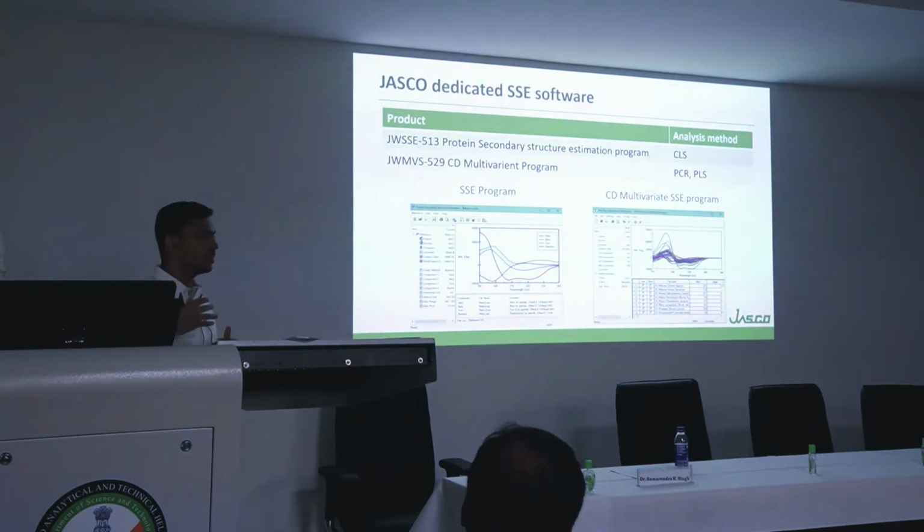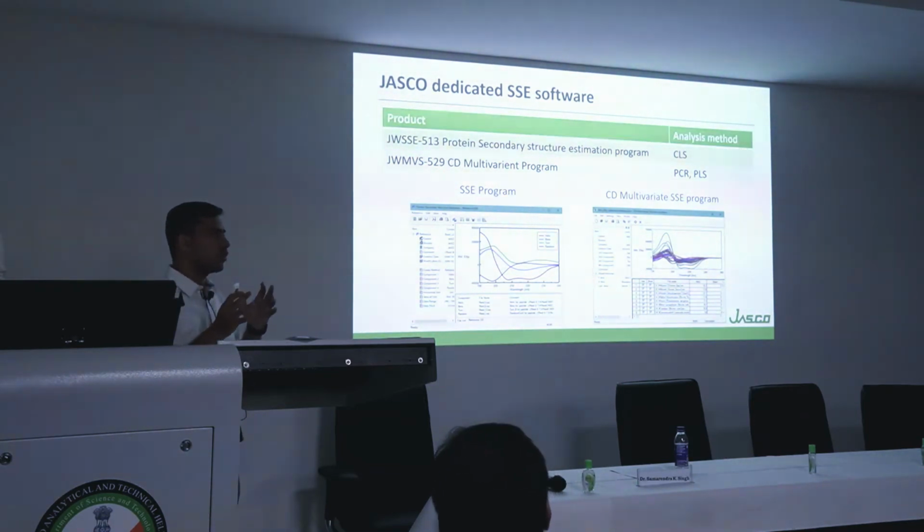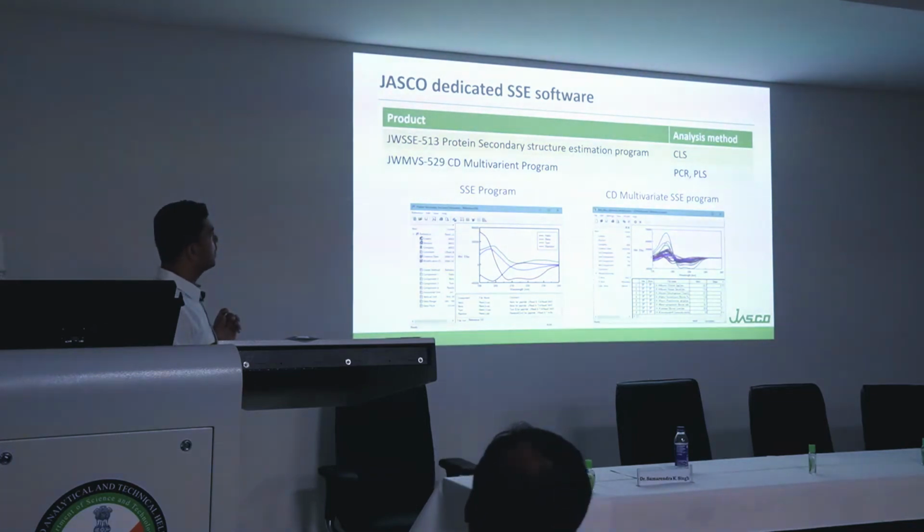Accordingly we created these statistical models, and you correlate your samples with them. If you have a good statistical model for the protein you are working on, it will give good predictability and good correlation values. The limitation appeared when we used this particular statistical library.